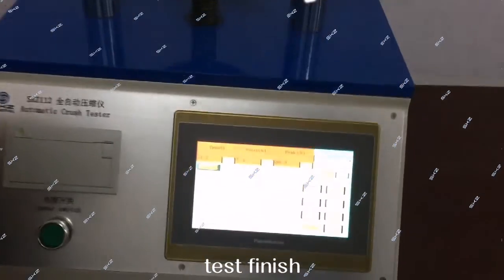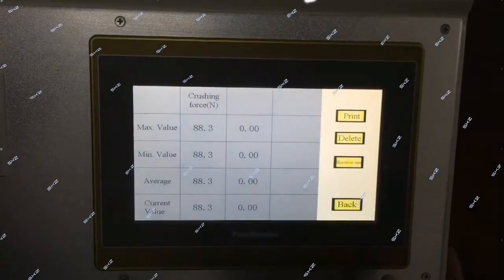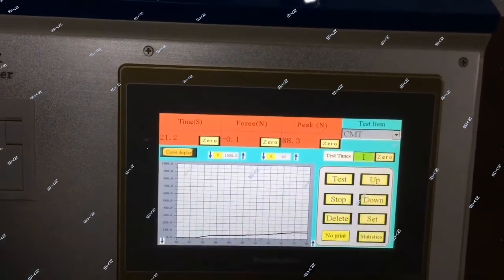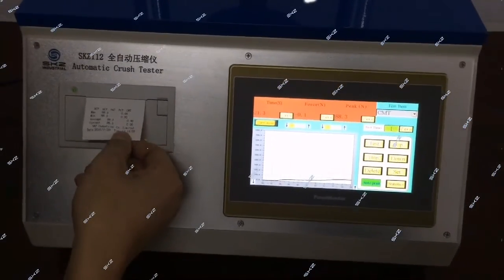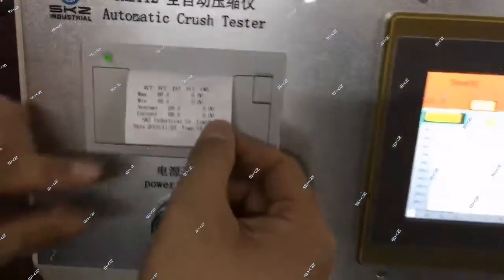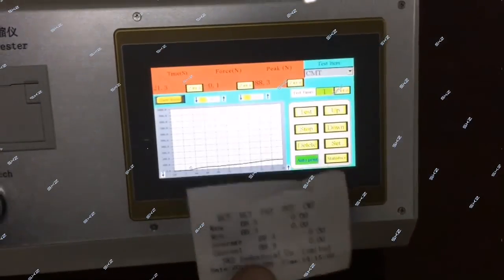Test finish. This is the test result. CMT — this is the test result. Finish.